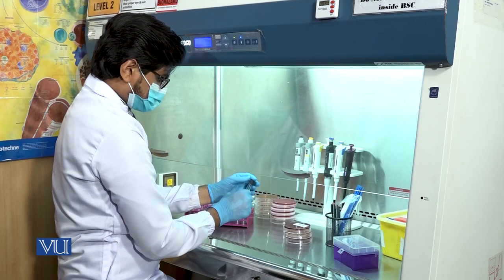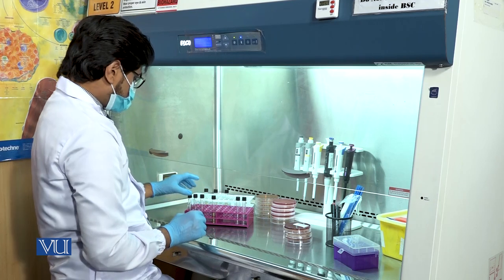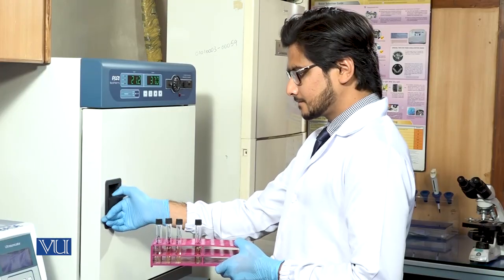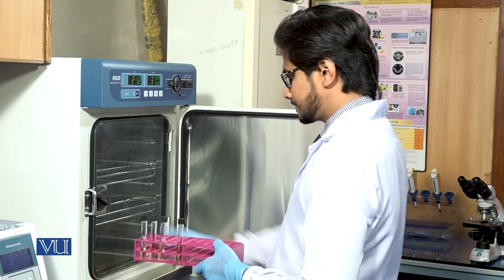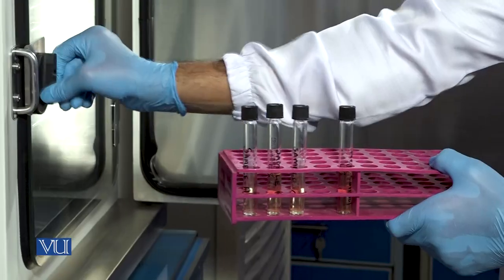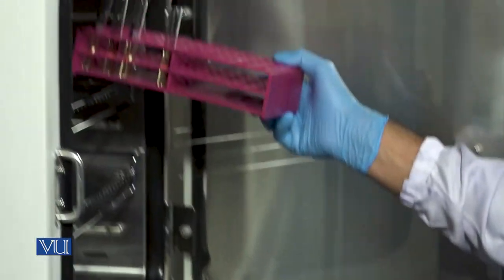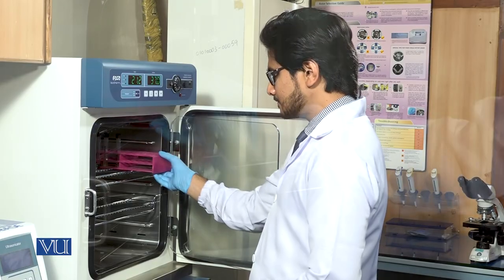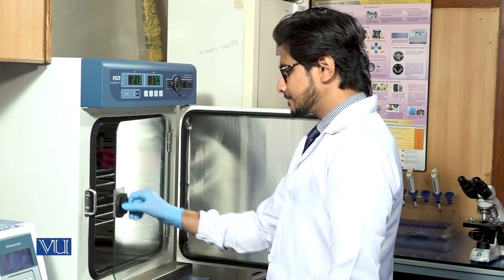Loosely close the cap of the glass tube so that it is not airtight. Place the samples in the incubator at 37 degrees Celsius, and securely close the incubator.